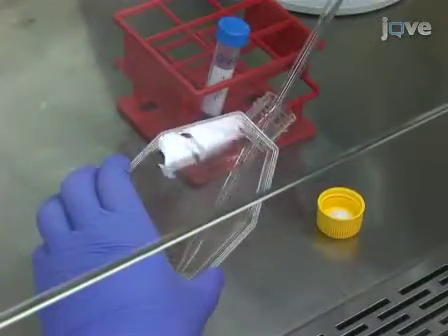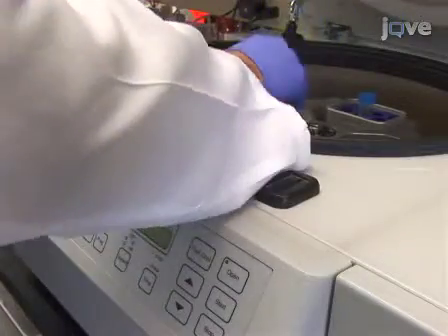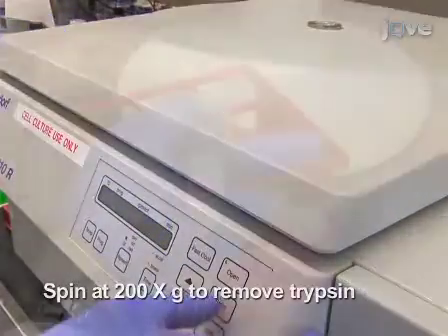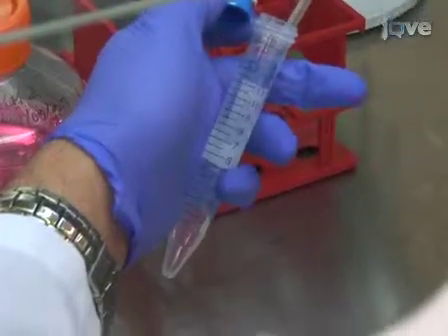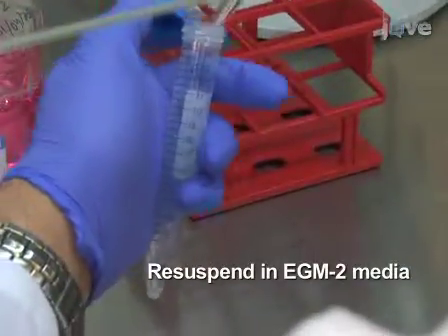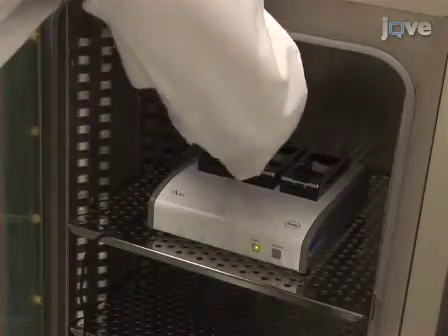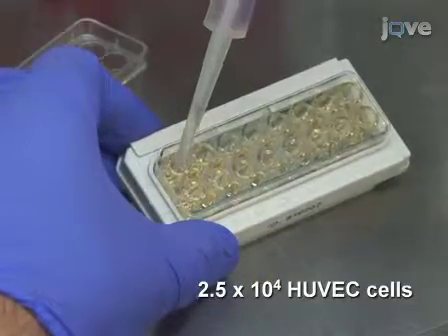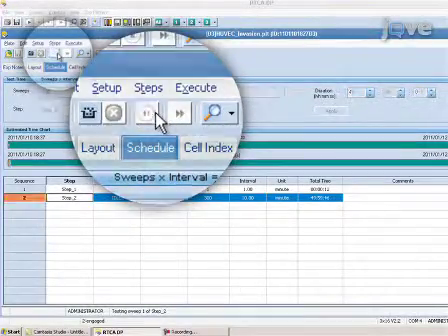To generate a HUVEC monolayer, harvest the cells by trypsinization. Once the cells have detached from the flask, all traces of trypsin should be removed by centrifugation at 200g. Following the spin, wash the cells once with PBS, then resuspend the cells in reconstituted EGM-2 media to a concentration of 2.5 × 10⁵ cells per milliliter. Once the cells are resuspended, remove the background-calibrated E-plate from the Accelogenz system and add 100 µL of the HUVEC suspension to the 100 µL of EGM-2 medium already in the plate. Immediately place the E-plate in the Accelogenz system cell analyzer. Start acquiring impedance readings by clicking the Start Step button in the software window.